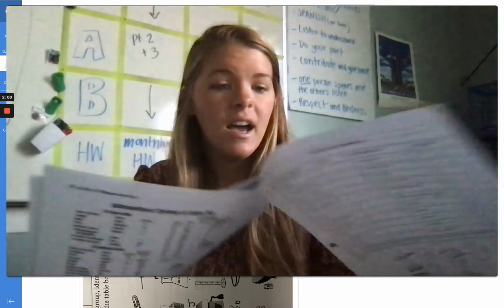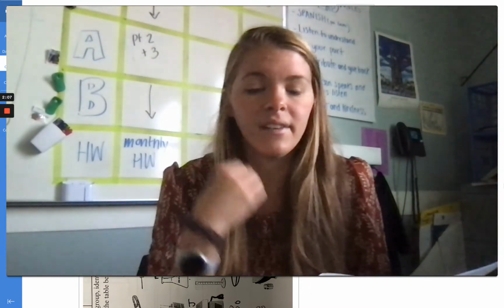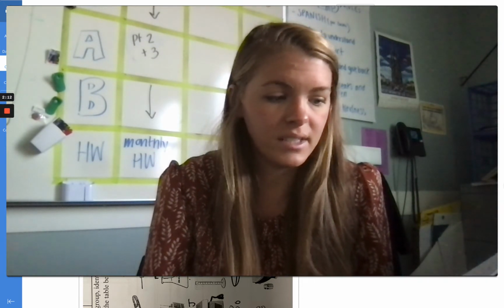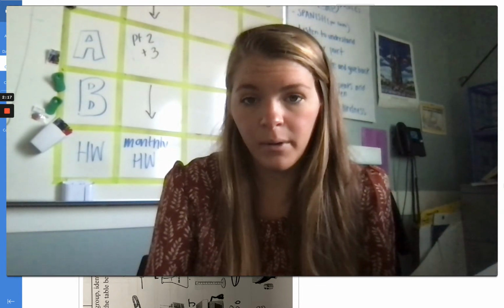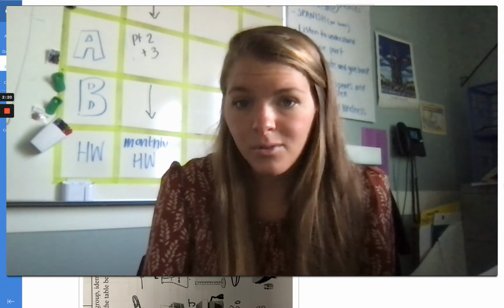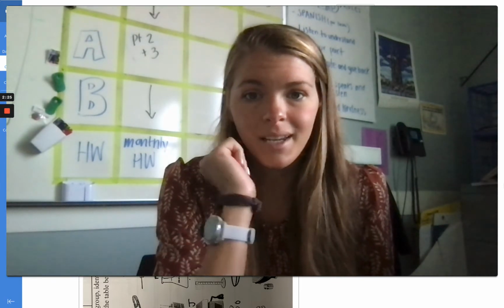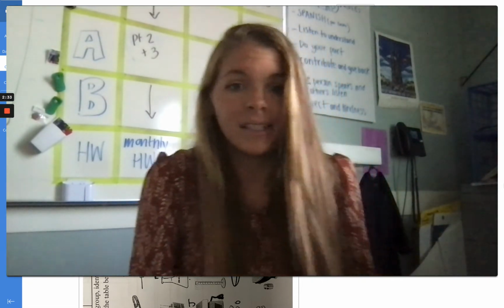After you identify the names of everything, on the back is a bunch of uses of the equipment. So what's their purpose? So your job then is to identify what piece of equipment has each purpose. So for this one, you're going to be using the actual name. So for instance, for task number 1, it says to use to measure an exact volume of liquid. So maybe you think that's a beaker, so you'd write beaker under equipment. Each piece of equipment is going to be used one time, so that can kind of help you out to figure out what needs to go where. That's the basis of this activity.